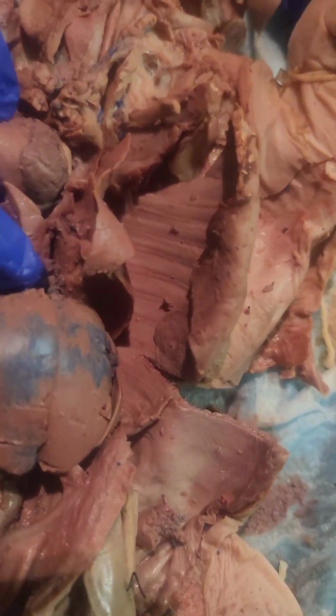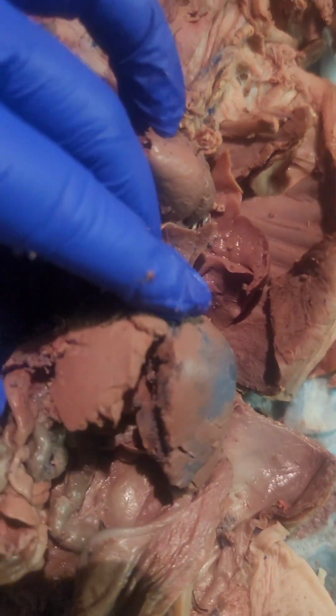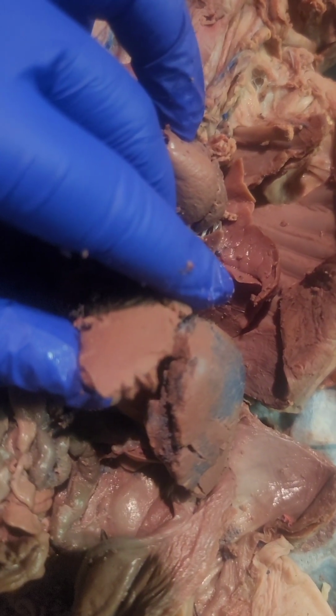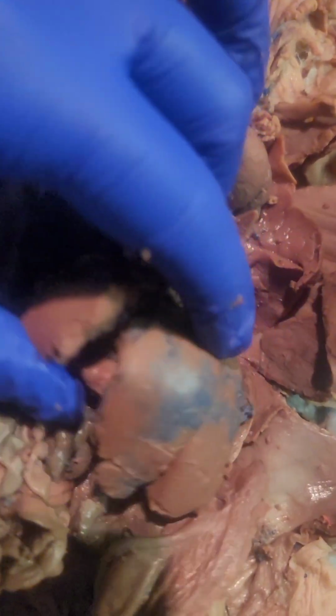And it goes around the diaphragm. Here's the diaphragm. And my liver is quite large, but for some reason mine has like exploded. It just doesn't look very pretty once you open it up.